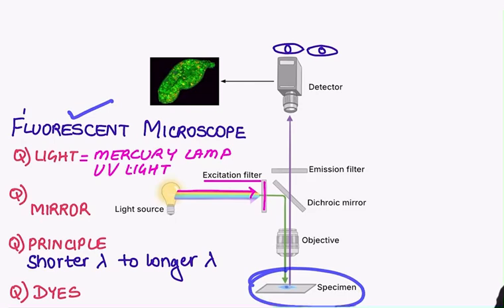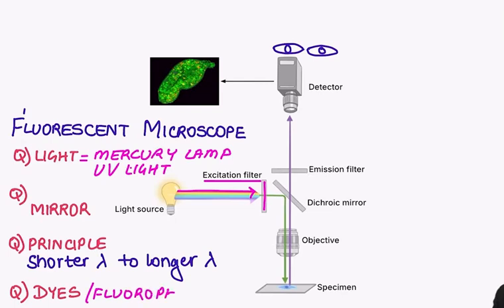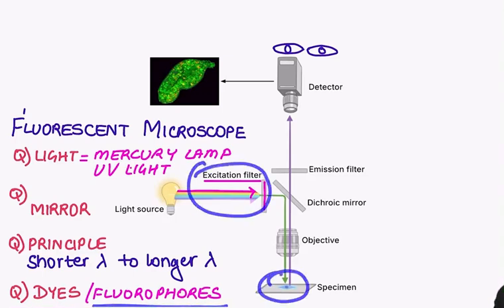Over there you do fluorescence and you see the fishnet and other patterns on bullous disorders. Maybe this is a microbiology slide where you're trying to see TB. Whatever may be the specimen, you will have to add some dyes, and these dyes are known as fluorophores. You can easily understand that fluorophore means some fluorescent dyes will be added. So if I'm adding a green color dye, I will have a different excitation filter. If I'm going to add a blue color dye, I will have a different excitation filter that the company and the protocol will be given to me.